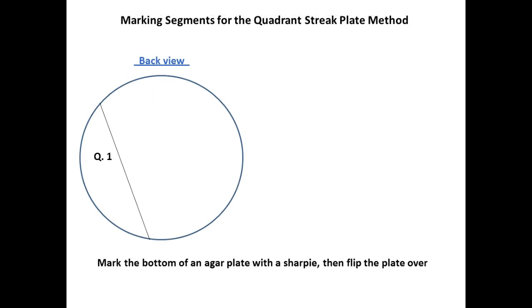So there's several different ways. A lot of times beginning students, when we're first learning, draw ourselves a little road map on the bottom of our plate. So I'll show you how to do that. This one has kind of angled lines. I'm not that high tech. But this is our plan. We'll start in 1. We'll move organisms from 1 to 2 to 3 to 4.